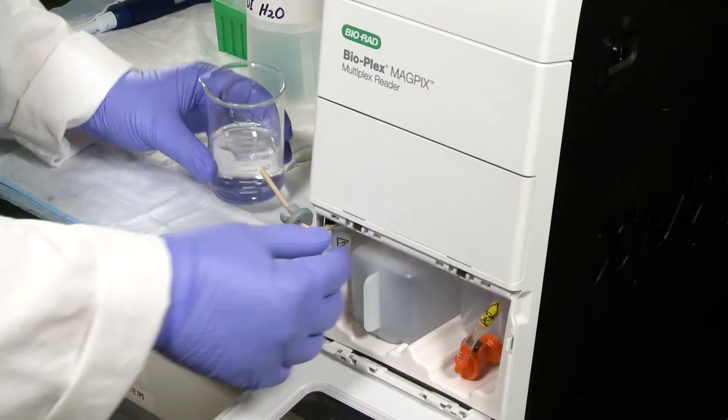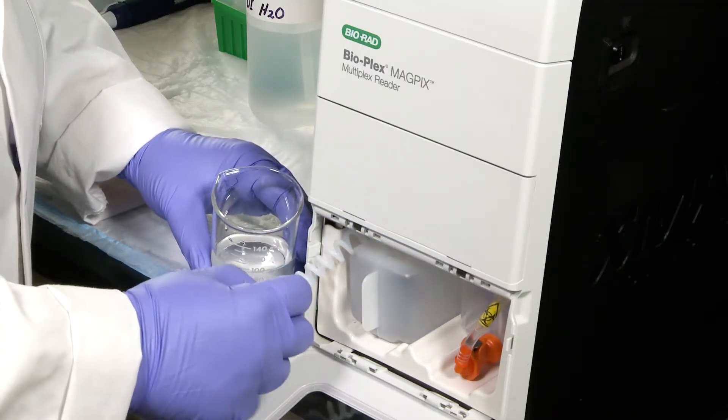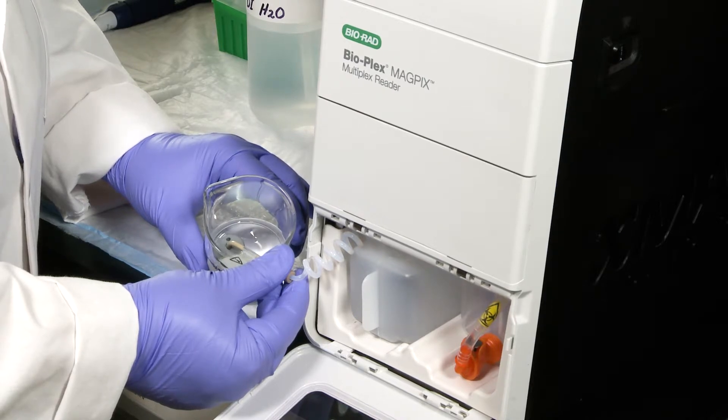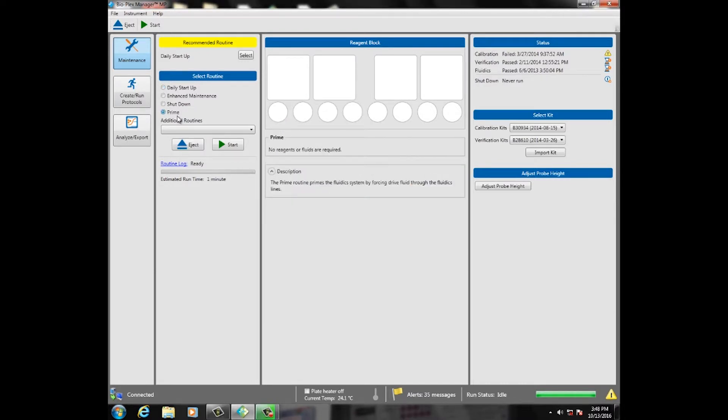Thus, 10 prime routines need about 60 ml of liquid. Remove the drive fluid probe from the bottle and place it into the reagent in the reservoir. You may have to hold it in place with your hand to keep it from slipping back into the instrument. In BioPlex Manager MP software, select the prime routine and click Start. Repeat this procedure 10 times.